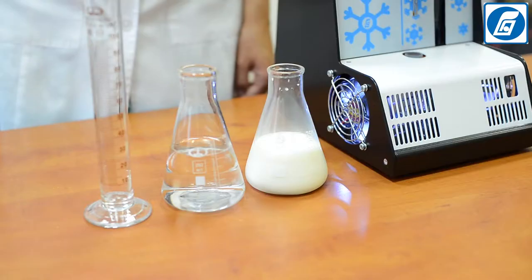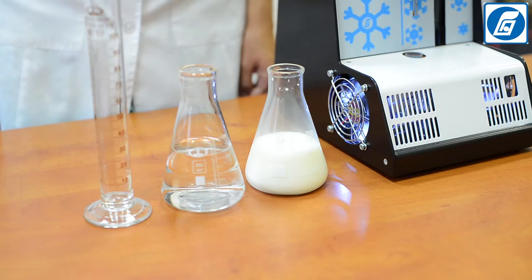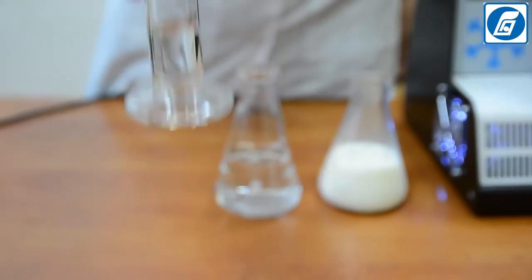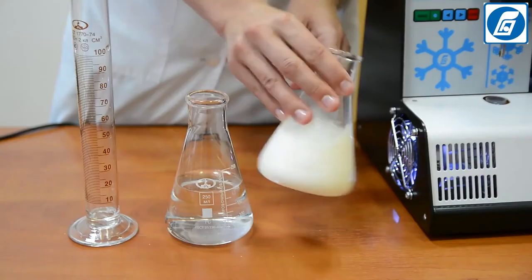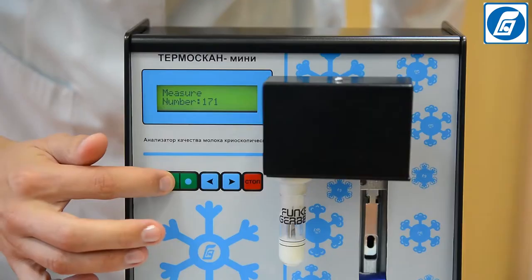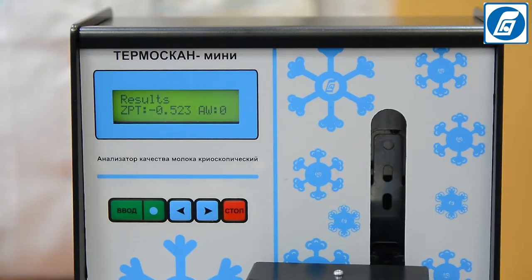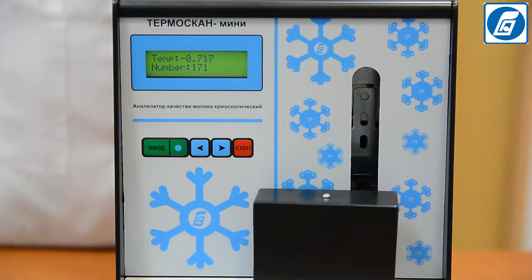Adding water to milk in order to increase volume is the most common and widely spread form of milk adulteration. Let's add 10% water to milk and see how the freezing point parameter changes. The standard freezing point value for natural raw milk is minus 0.52 degrees. Testing of milk with added water showed that the freezing point value shifts from the normal level of minus 0.52 in the direction of increasing values — that is, the result shifts closer to zero, which is the freezing point value for water.